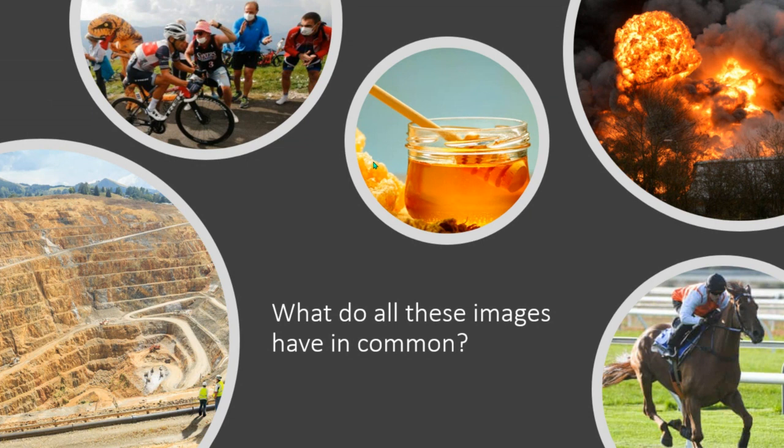So, without further ado, I'm going to get Kat to do a demonstration on UV vis. And before we move on, can someone tell me in the chat or through their microphone what UV vis actually stands for?